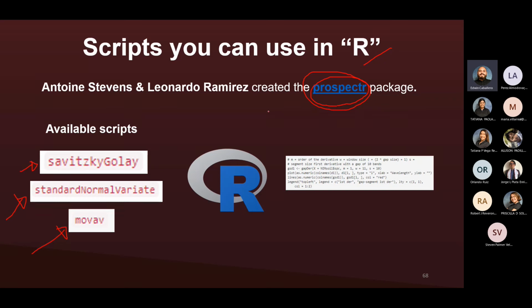Normally, the argument is that if you want to do statistics, R is more recommendable than Python. Python is a lot more general. However, if you just want to stay in statistics, R is a lot more friendly. In essence, the way you program in Excel is very similar to how you program in R. So if you know Excel, it's also a lot easier to get to R.